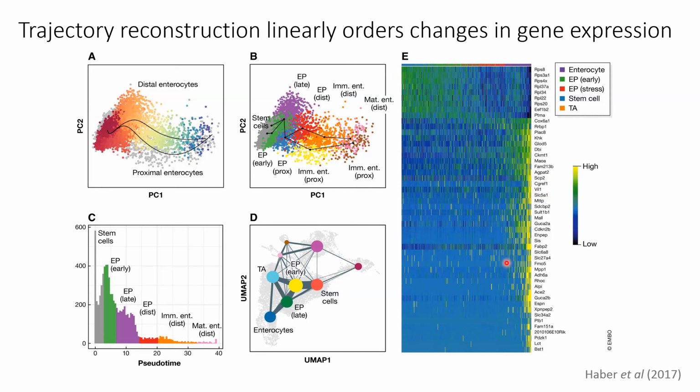So overall, pseudotime represents not necessarily how cells transition between cell types in organisms, but how their transcriptional profiles can be ordered if we line them up according to linear transitions or forced gradients in expression patterns.